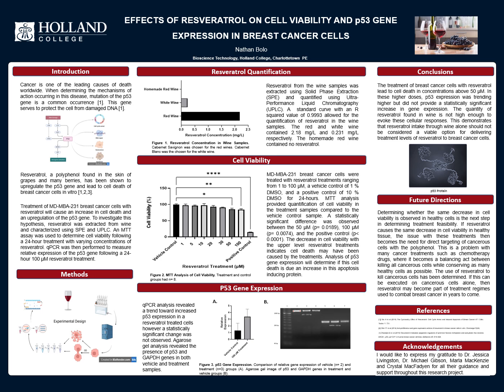With most of the resveratrol located in the grape skin, it has become clear why the red wine contained higher concentrations of the polyphenol. The homemade red wine, which was produced from a kit, did not include any grape skins, which led to no resveratrol being identified in the wine sample.